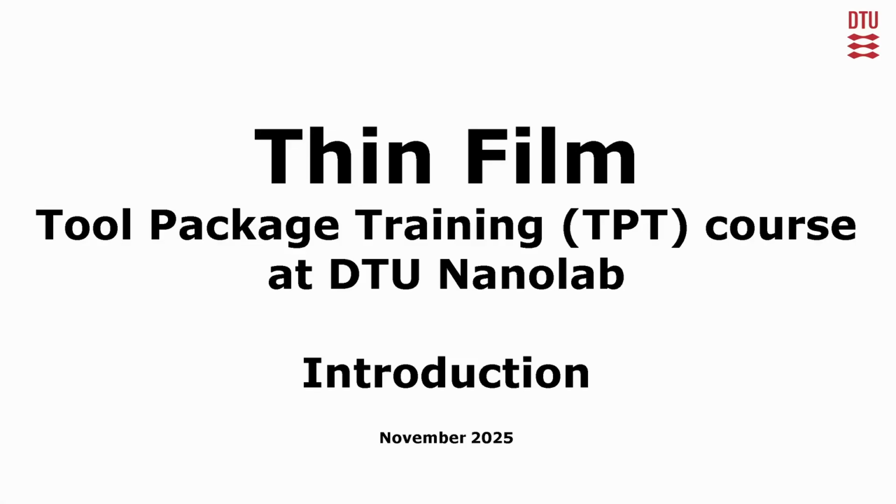Welcome to the Thin Film TPT, Tool Package Training course at DTU Nanolab. The course consists of several lectures covering physical and chemical deposition methods.